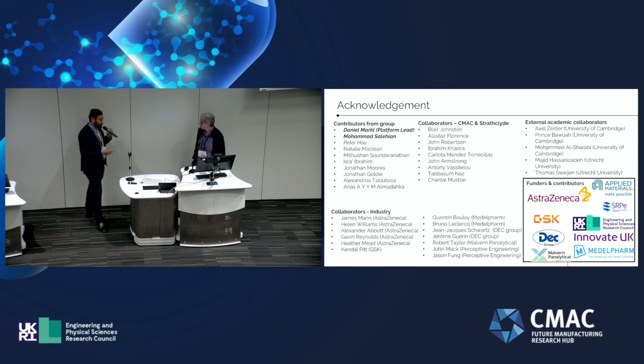There could be multiple purposes for using NIR spectroscopy. One of the main reasons was to identify any kind of blend homogeneity. If there is any non-uniformity in the blend, it could be identified, so that instead of using that same powder for producing a tablet, we can recycle that powder and blend it again. In the future the plan is to have an automated blender as well, so that the decision could be taken in real time and we can release the powder back into the blender, blend it again, and keep doing that until we are satisfied with the blend homogeneity.